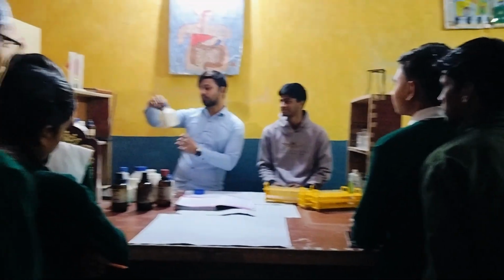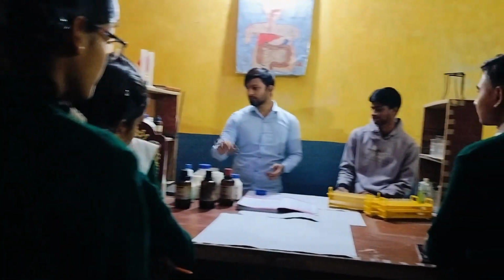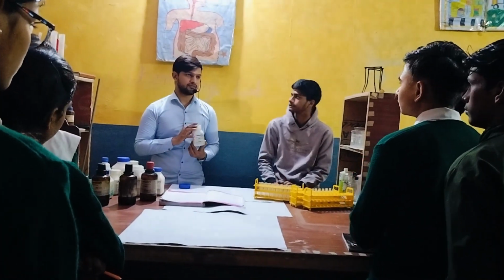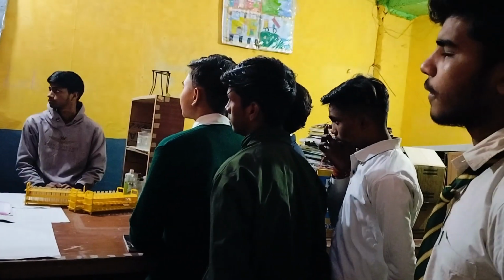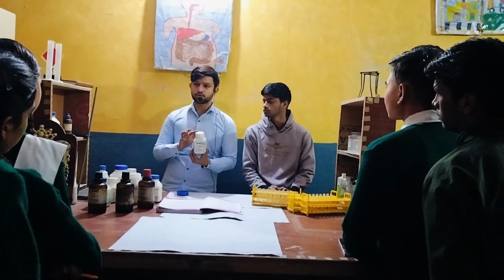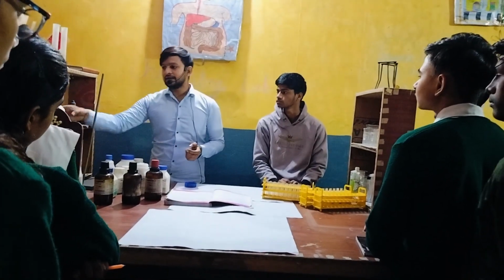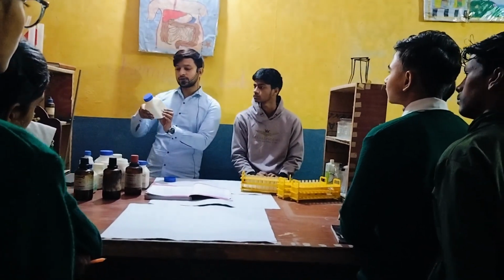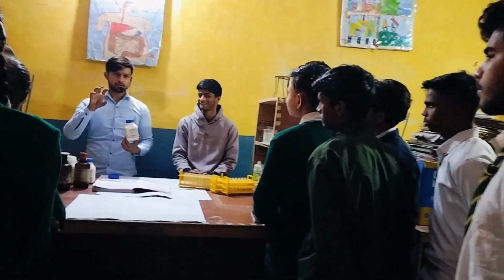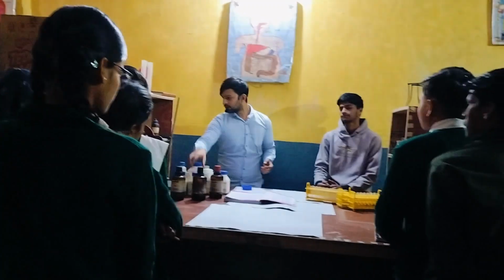This is barium chloride, the formula is BaCl2. Next we have cupric sulfate, that is copper sulfate, which is blue in color, CuSO4. When we perform the experiment, I will show you the color and how it reacts. And we have sodium carbonate, that is Na2CO3. So we have almost all types of salt with us.